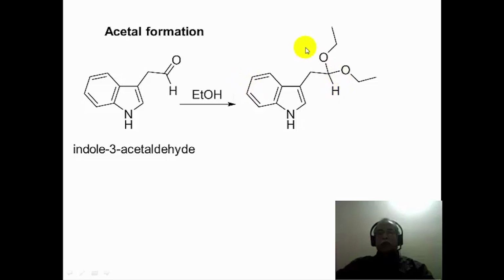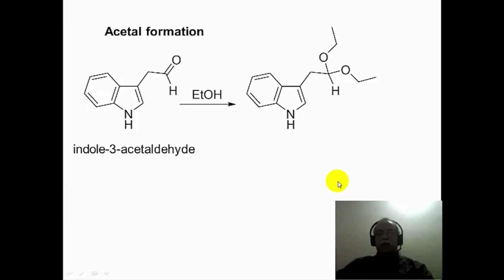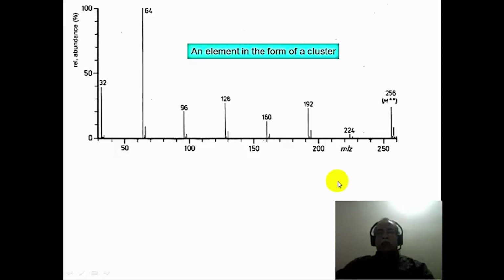So the structure of this molecule, in terms of its molecular weight as well as the fragmentation pattern, has been accounted for by the mass spectrum that is shown in the picture in this particular problem. Let us move on to the next problem.